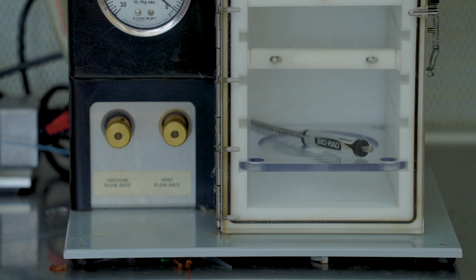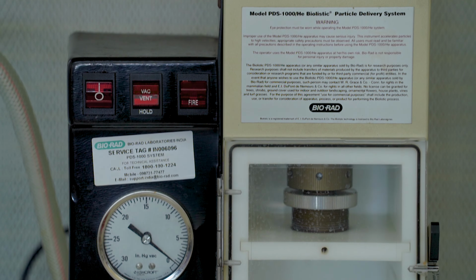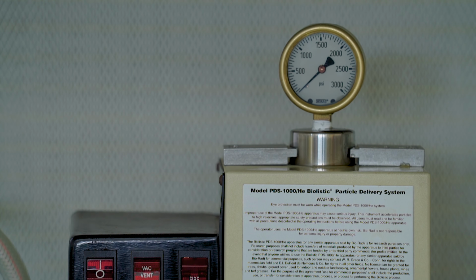So whatever we have demonstrated today is the indirect method, that is called Agrobacterium mediated transformation. But there is another method called the direct method, which is the particle bombardment method, a gene gun, where we use gold particles on which we can coat our gene of interest, either the plasmid or even the gene of interest with the promoter and terminator, and we can bombard it into the target tissue. These gold particles pierce up to the cytoplasm, and some of the gold particles go up to the nucleus, and through recombination there is a chance that we can introduce any foreign gene through particle bombardment also.